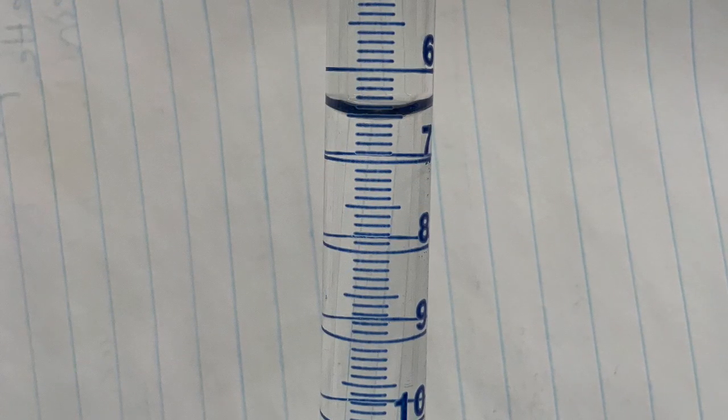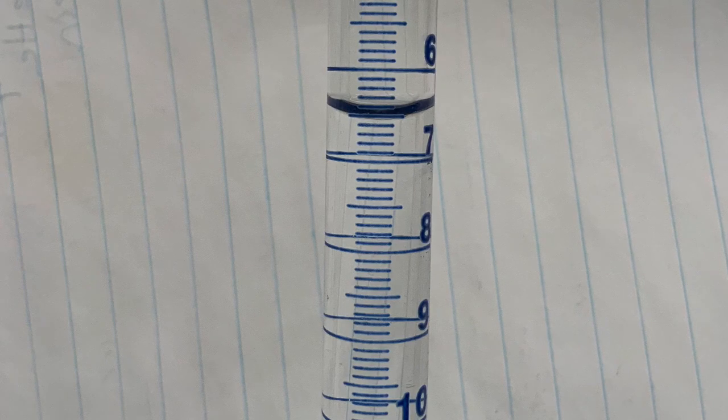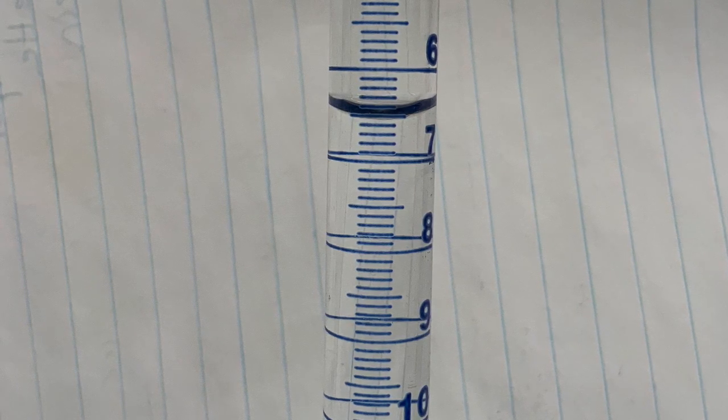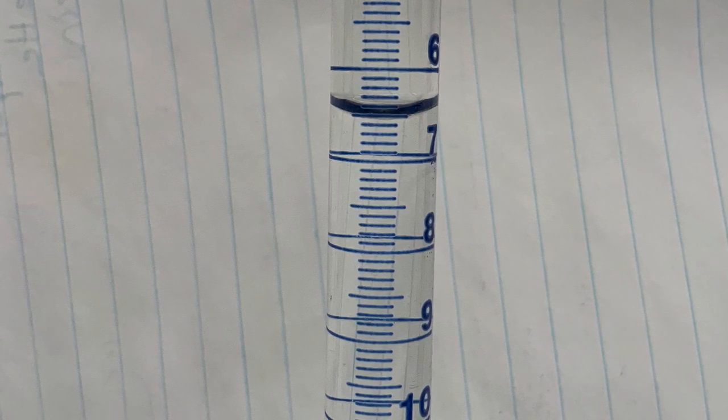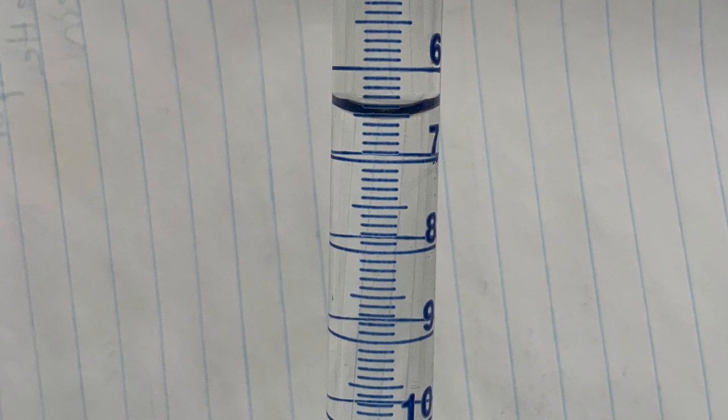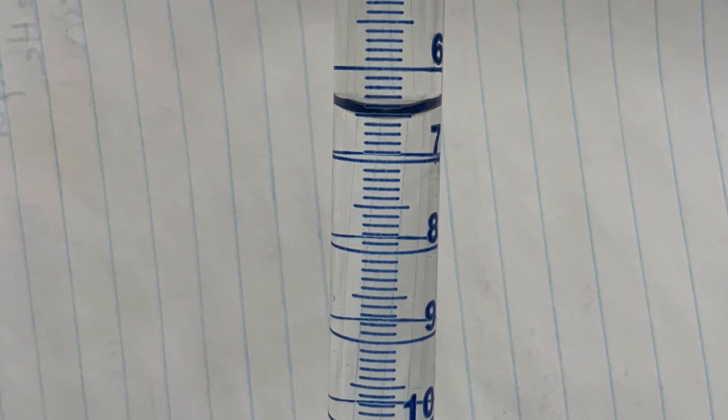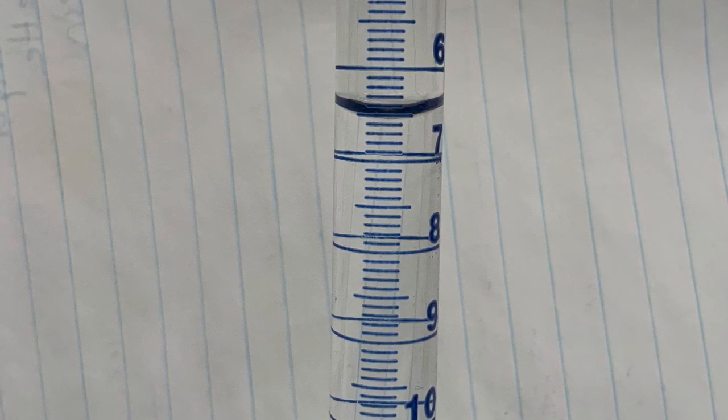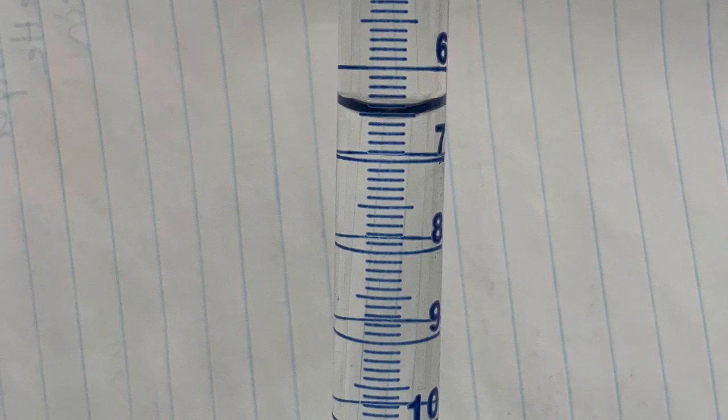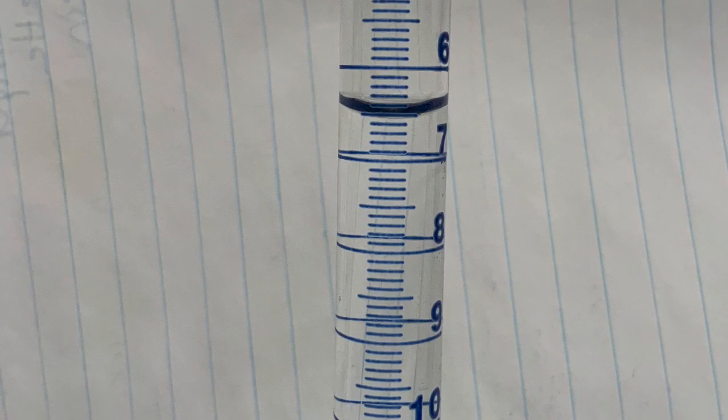Then we fill the burette with fresh sodium hydroxide solution and we do not want to waste time trying to hit the 0.0 milliliter mark. We fill it near the top and then record the reading, in this case 6.5 milliliters, that's our initial reading.